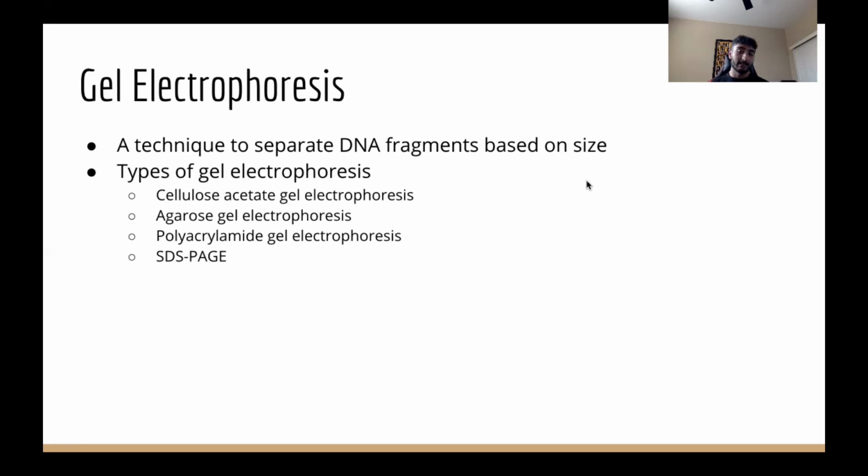And next, we have SDS-PAGE. SDS-PAGE separates proteins primarily by mass because the ionic detergent, which is SDS, denatures and binds to proteins to make them uniformly negatively charged. Thus, when a current is applied, all SDS-bound proteins in a sample will migrate through the gel toward the positively charged electrode.